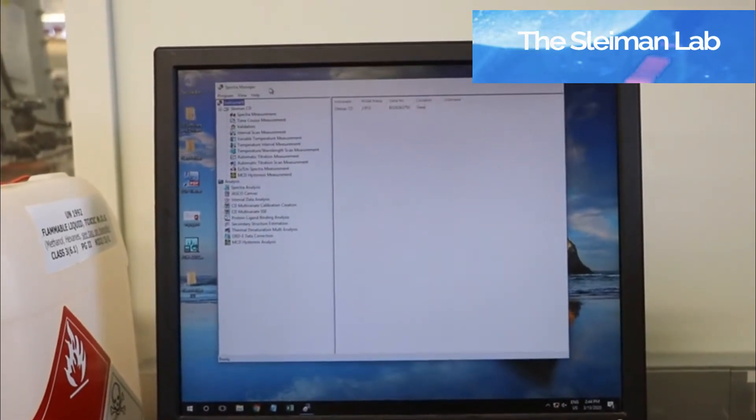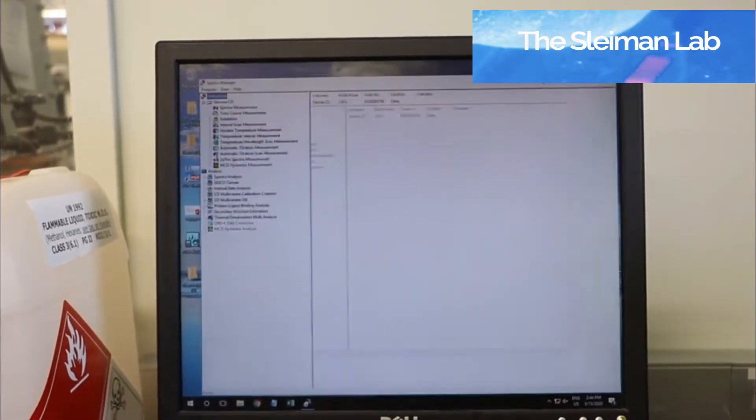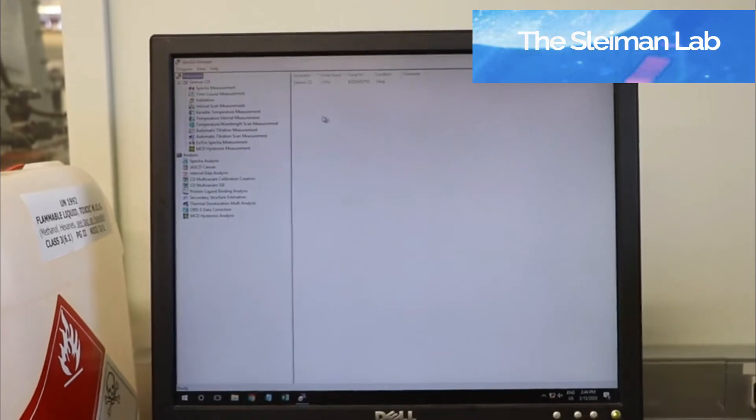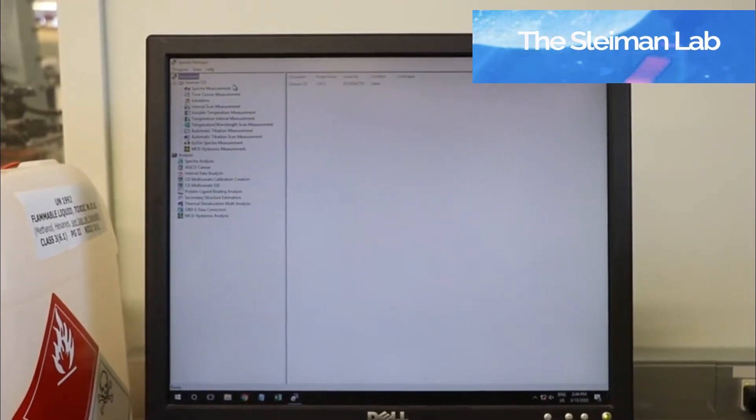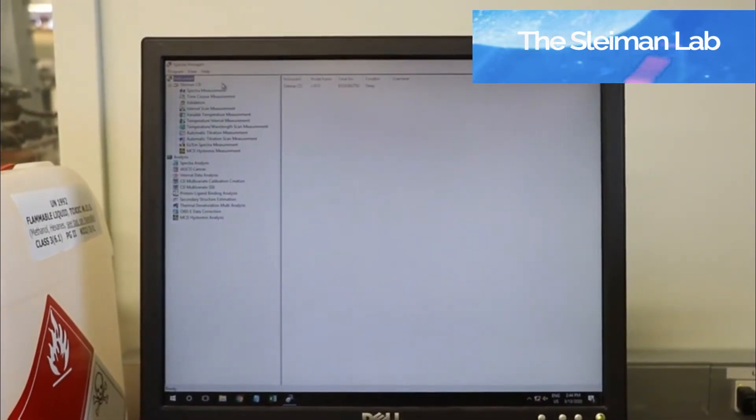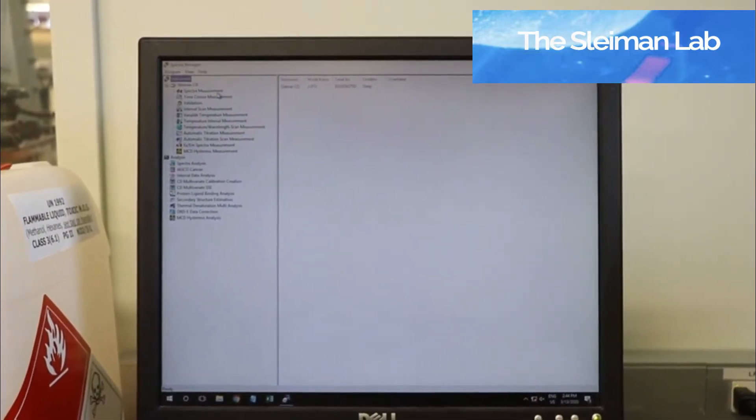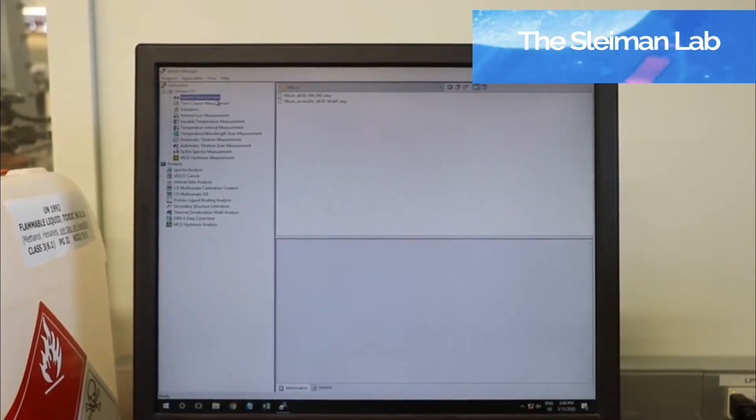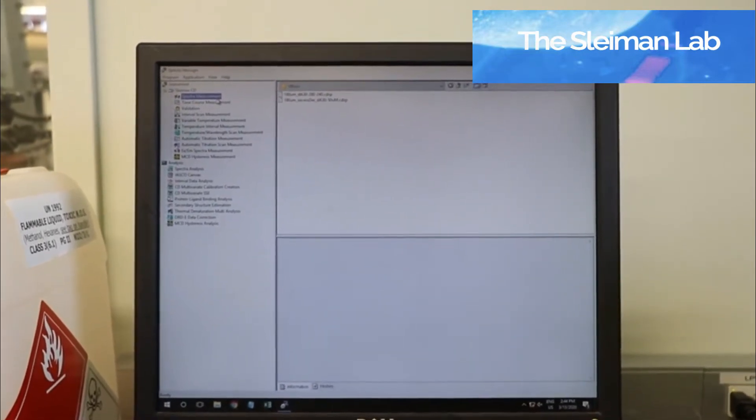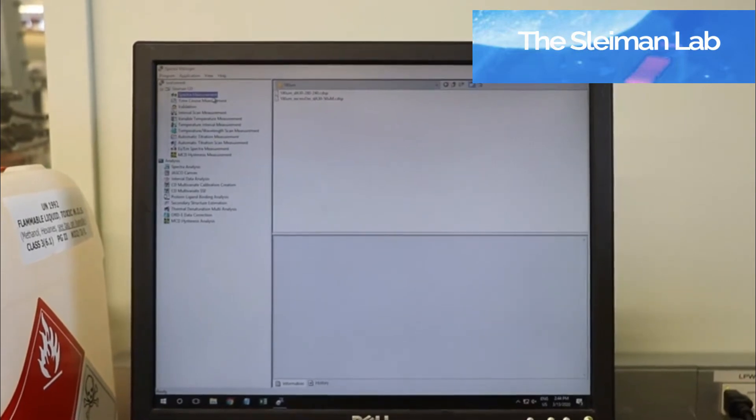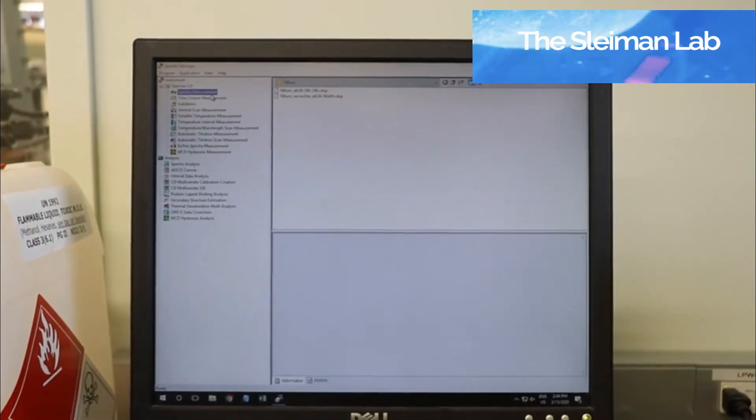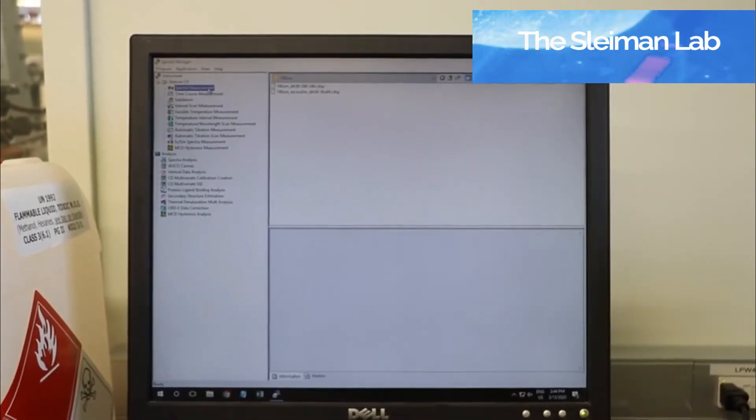Here in the Spectra Manager window, you'll have the choice of the possible experiments you can go through. The spectra measurement is a simple measurement of a spectra around certain wavelengths at a fixed temperature.